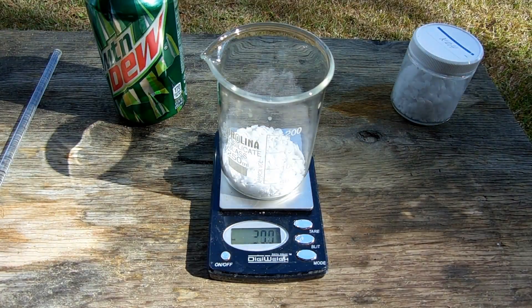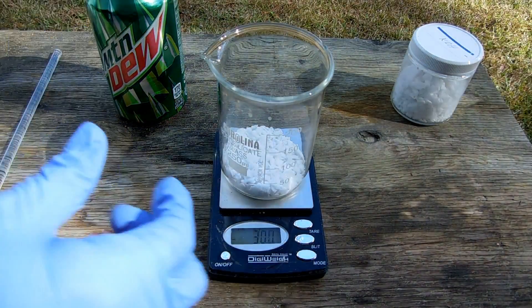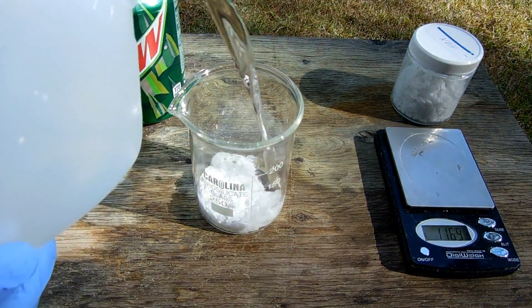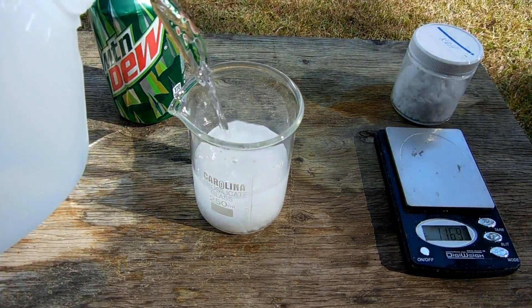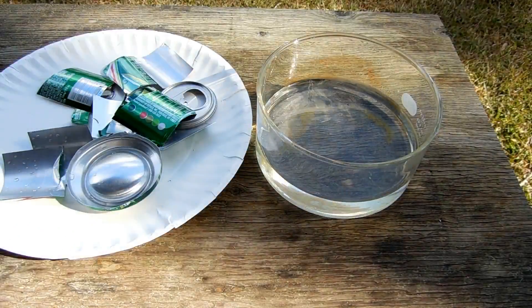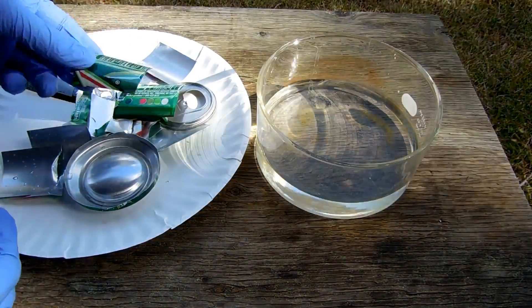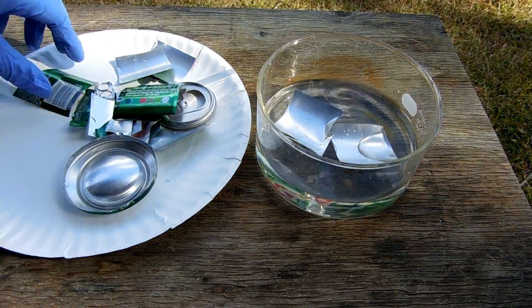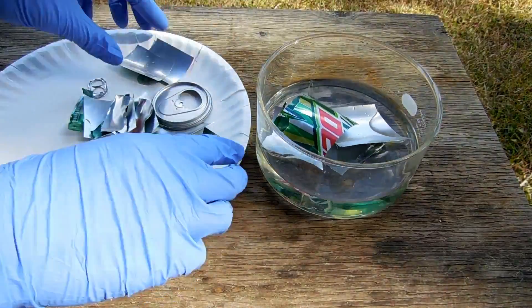We'll dissolve that in about 200 milliliters of water. I've cut my can into a bunch of smaller pieces so that it will hopefully react a bit faster. Now we're just going to pop this into the potassium hydroxide solution.